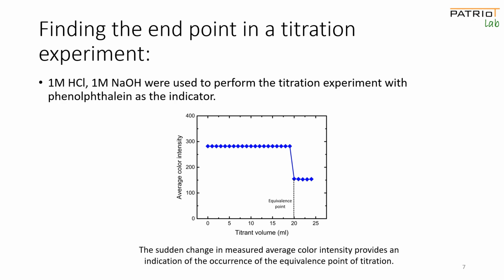It is observed that this versatile low-cost color detection system gave accurate results and could thus be employed for use in various industries on a large scale to completely automate the chemical and biomedical processes.